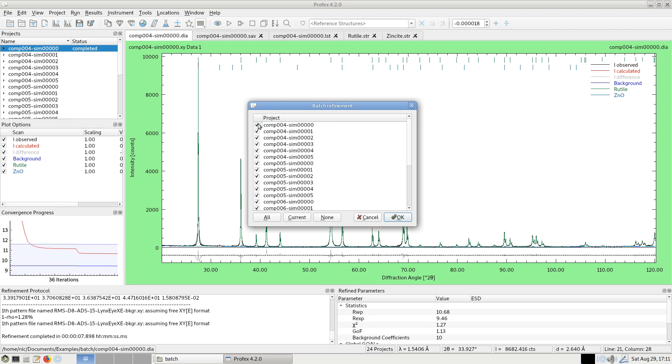And actually, we can skip the first one, the one we see in the background, because it's already completed. So I can save a minute or two by deselecting it. And we start with composition 4, dataset 1, and click OK.